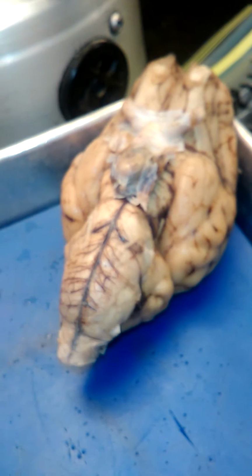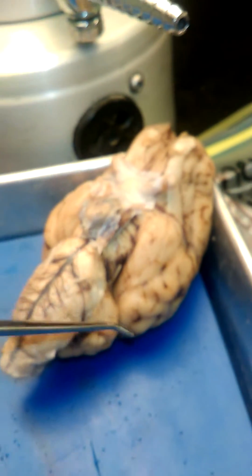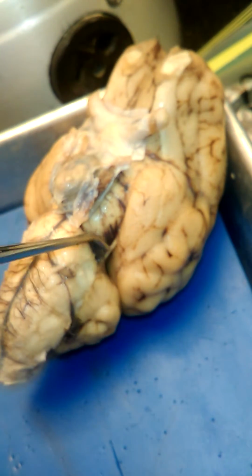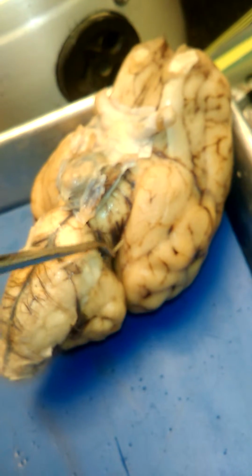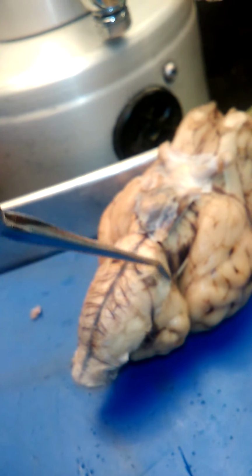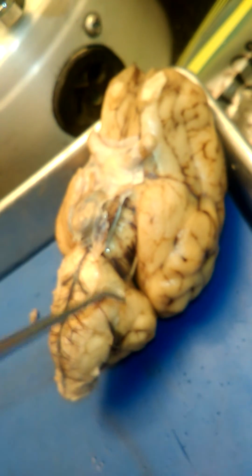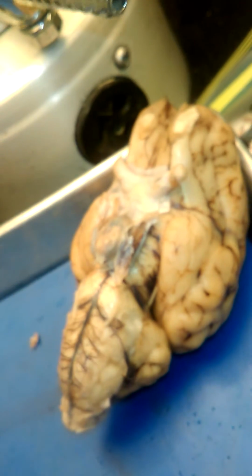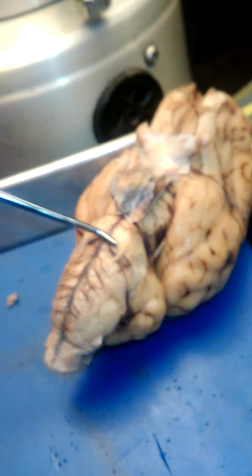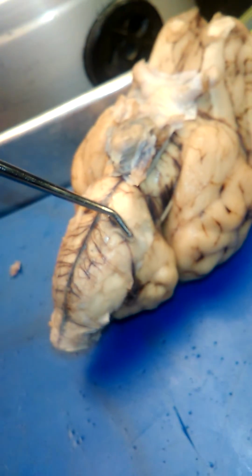Next, we have the trochlear nerve, which is right here. Can you see that? That is the trochlear nerve. And then I have this one right here. It's been torn off. You can't see it though. It's been torn off, and it is the trigeminal nerve, and it's been ripped off. And then this one right here is the abducens nerve. You see it? It's real little.